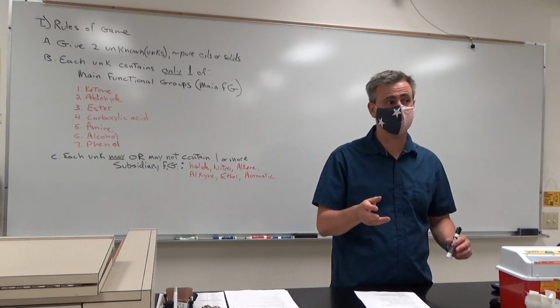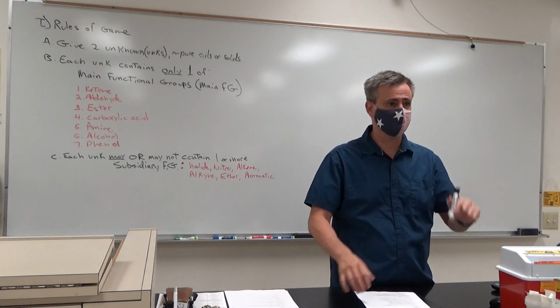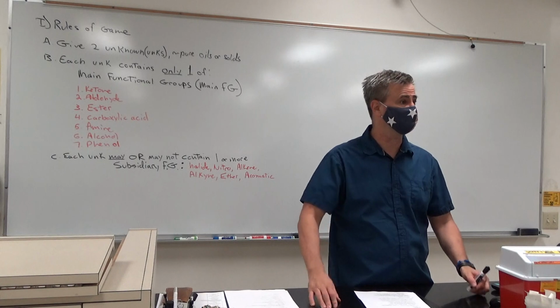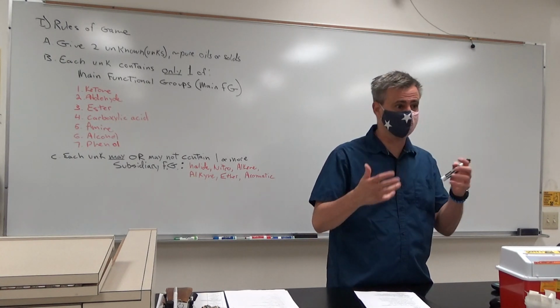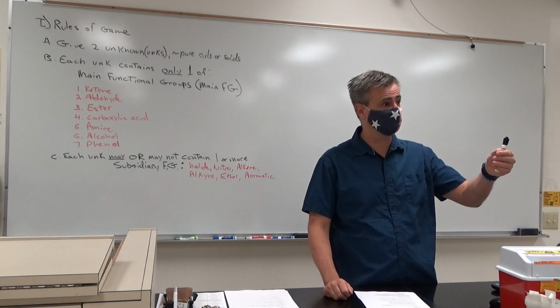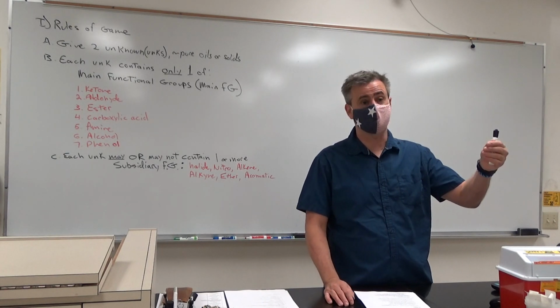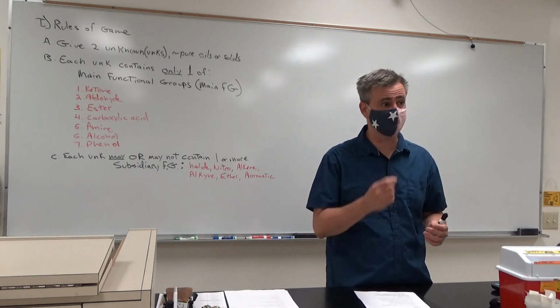NMR and C13 will also give you what that carbon framework looks like. The qualitative tests don't give you very much information in terms of that, like how this thing is assembled, what's right next to each other. If I've got a singlet around 0.9 that integrates for 3, that's probably a methyl group without any neighbors.